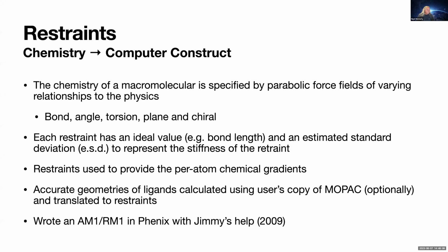And with Jimmy's help in 2009, I wrote some C++ code to calculate AM1 and RM1 in Phenix, so that the users were getting that as part of the distribution.